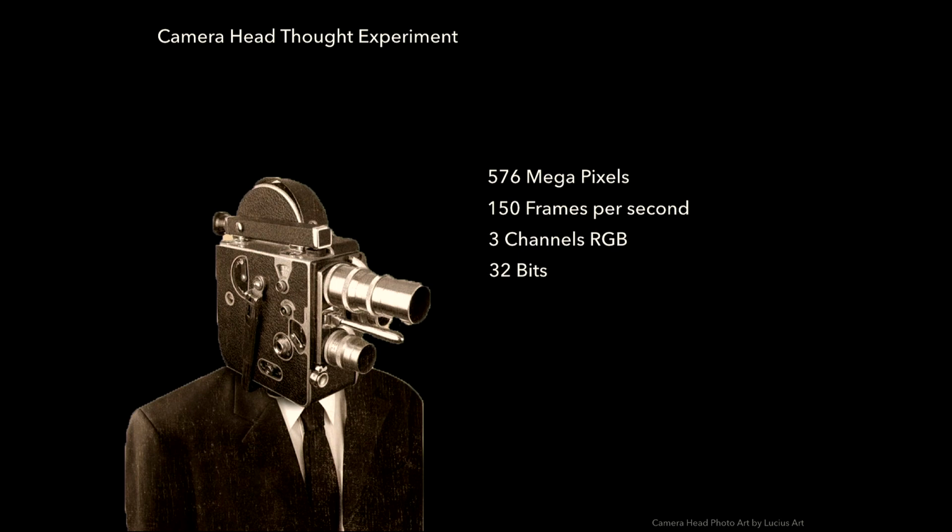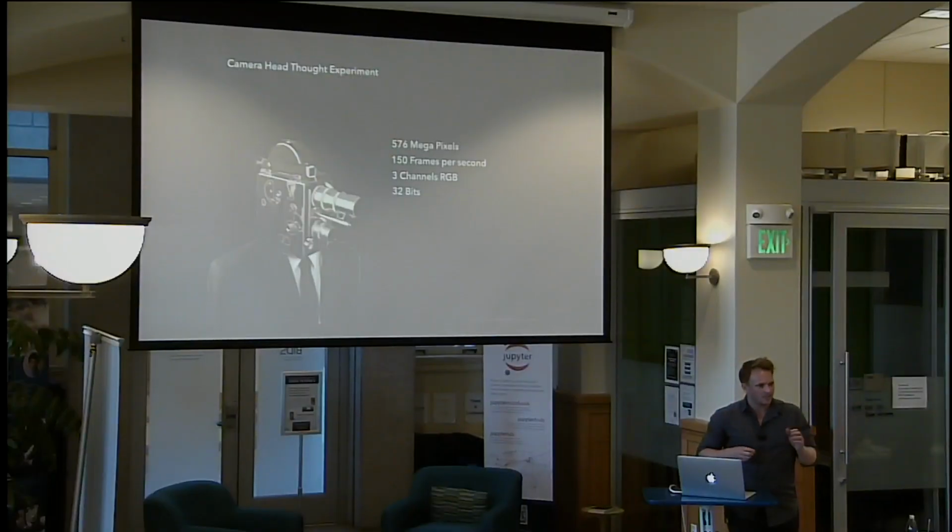Sorry. Could you talk a little bit more about the physics of the light-matter interaction? Is it just attenuation? Exactly how does this imaging process work? Is it membrane? Is it cytoplasm? Okay, so at the scale that I'm looking at, these here were nuclei that are labeled. The general idea is any contrast-labeled structure, where they've been labeled with fluorescent proteins, and then a light is shining on it, it illuminates and emits another wavelength, and then you detect that. So it's pre-emitted? Yeah.